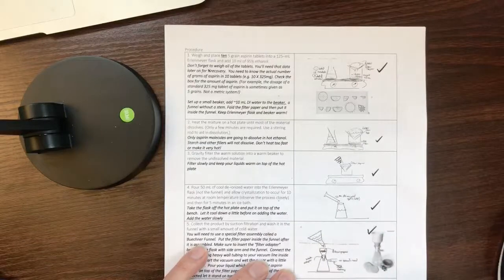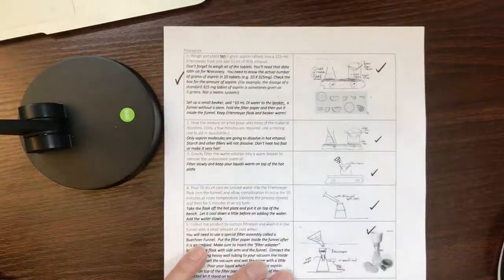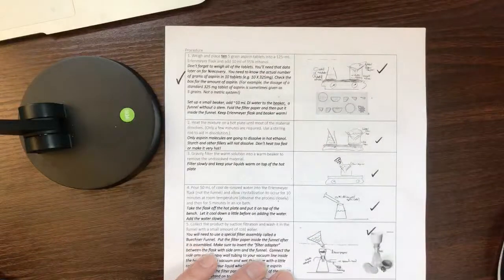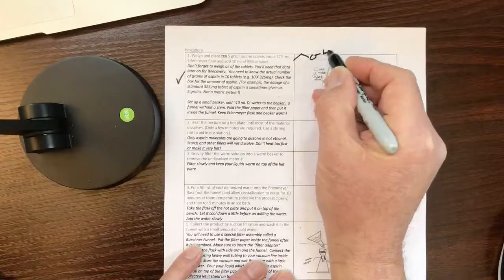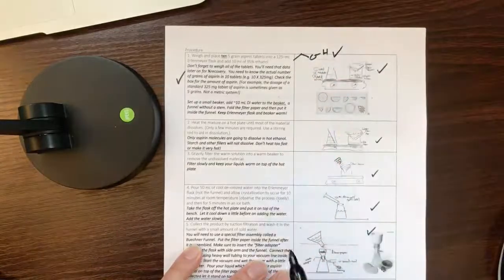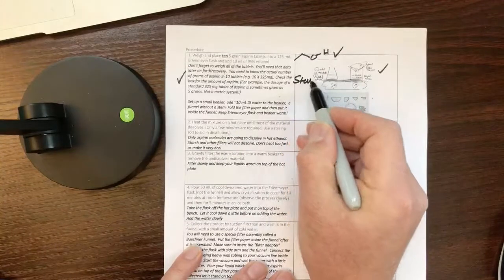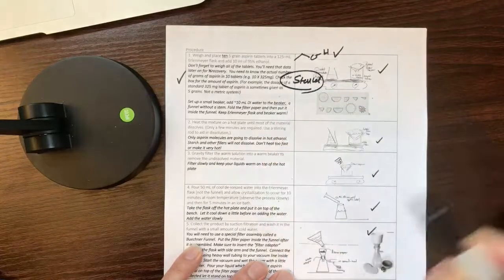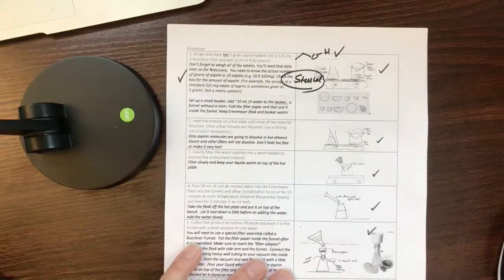So the key is, we weigh the aspirin and we put it in. The aspirin itself dissolves in ethanol, but the fillers and the starch don't. So that's how we separate the aspirin from the starch.